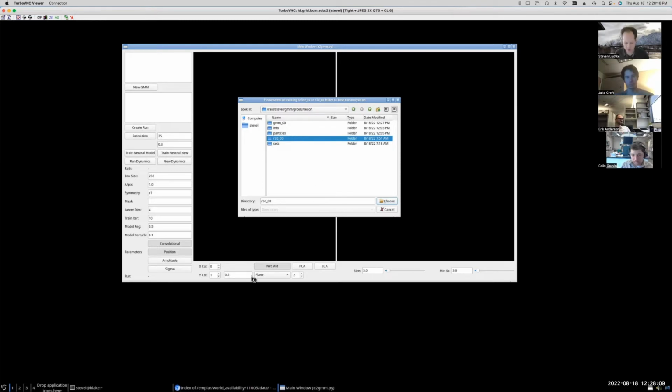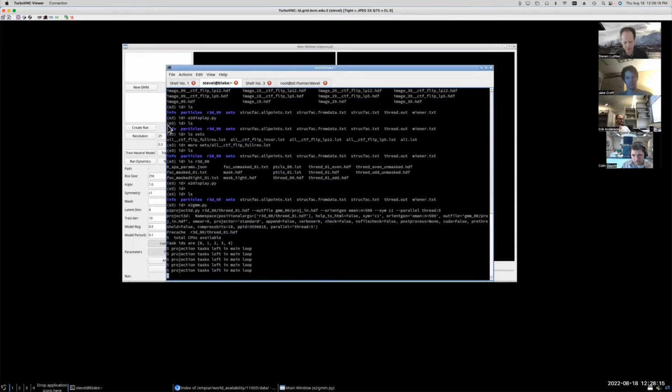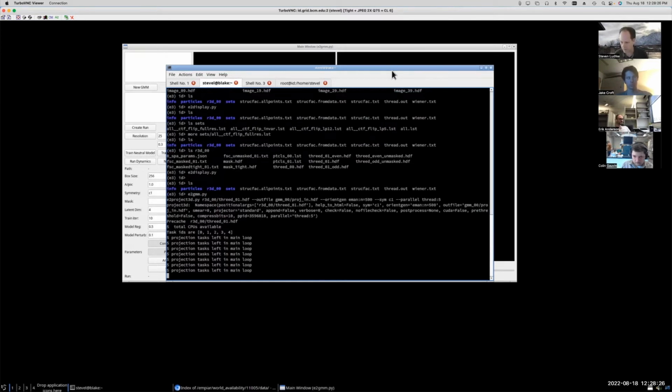And maybe I should bring the terminal window out somewhere where we can see it, so we can sort of see what's going on. All right, dragging isn't working right. Oh, that's not working right either. Interesting. Well, we'll just wait till it finishes now that we've got it in the front.